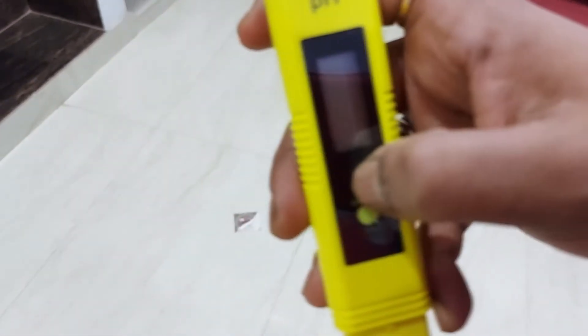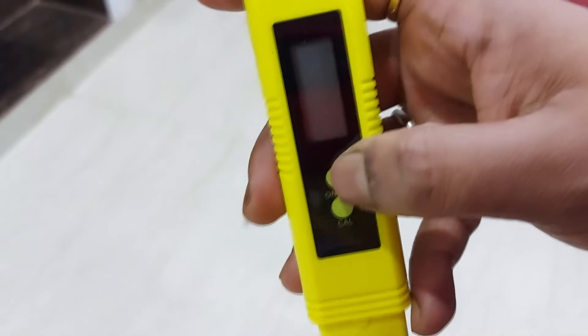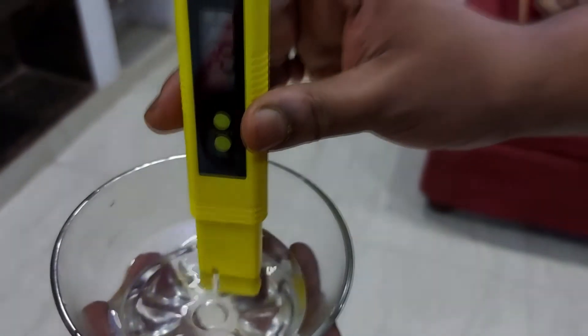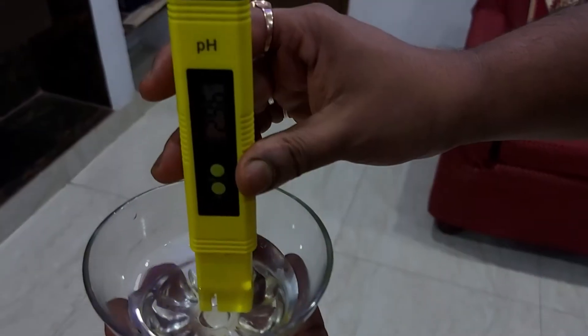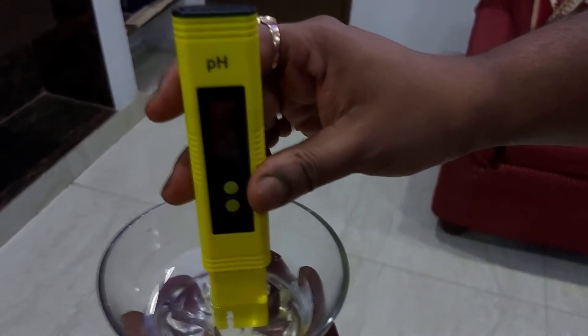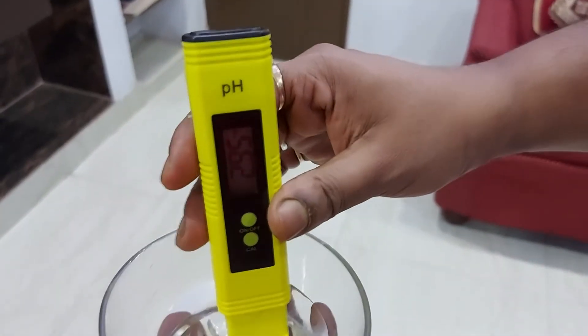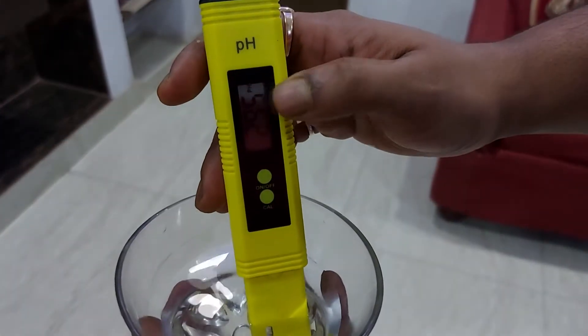The pH is now reading 2.77 going up. Now you can see clearly — dip till that mark only, you have to dip below that mark. Now it's stable at 2.96 to 2.95 — the lemonade solution is 2.95. The pH meter is now fully working.